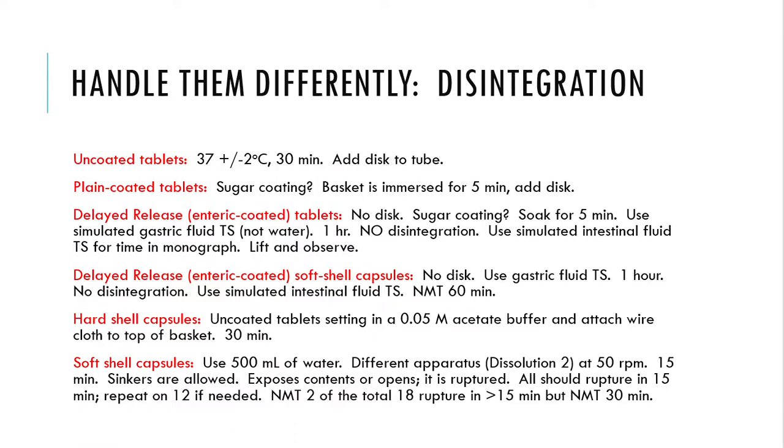So a typical uncoated tablet that you're seeing right here has a bath, a water, or a fluid in the beaker at 37 plus or minus 2 degrees. And the disintegration is going to be run for 30 minutes. And it's 30 minutes for whatever the pill is, unless it says something different in the monograph. If time is not given in the monograph, we assume it's 30 minutes because that's how this method is written. And you do add a disc to that tube if you have an uncoated tablet. All right? Okay, so these are run-of-the-mill, pretty cheap, pretty standard, typical aspirin tablets and things like that.